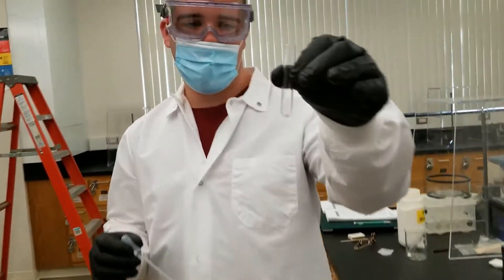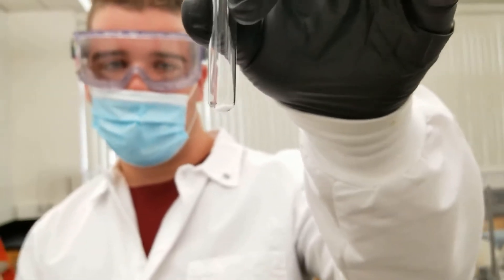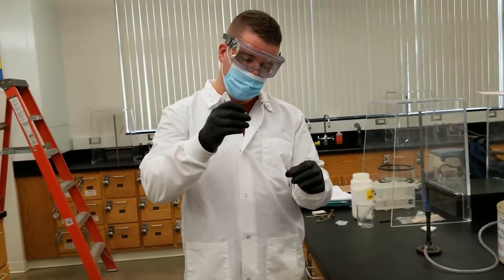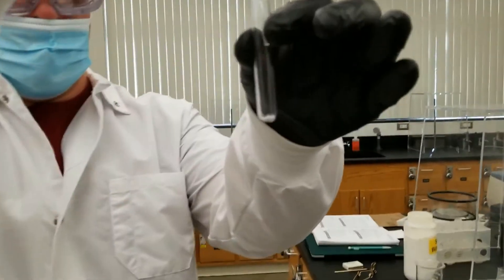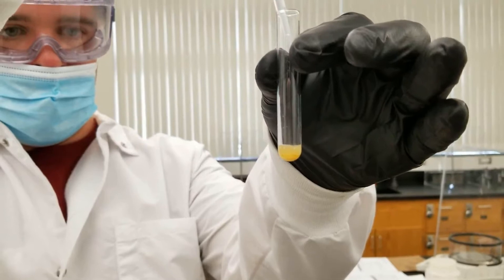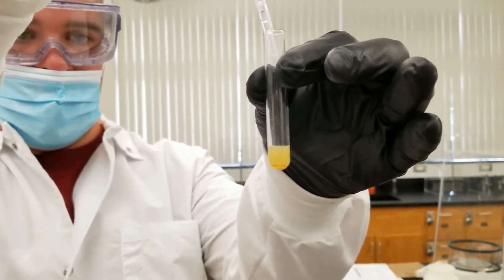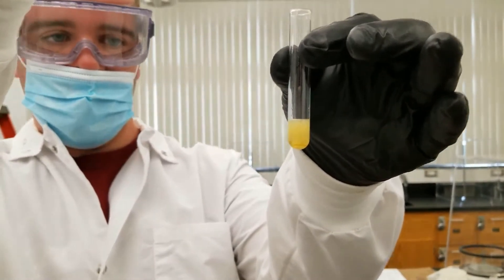Here we have our potassium iodide. I've measured out about 0.15 grams of it, and I'm going to add about a milliliter of hydrogen peroxide. After I add it, we are going to do a glowing splint test to see what gas may be forming.